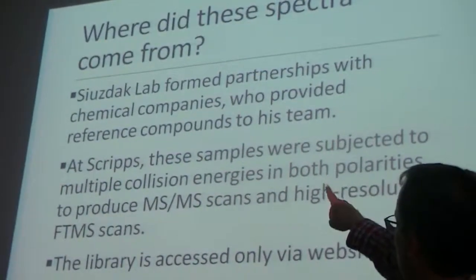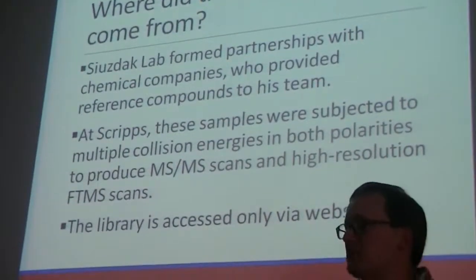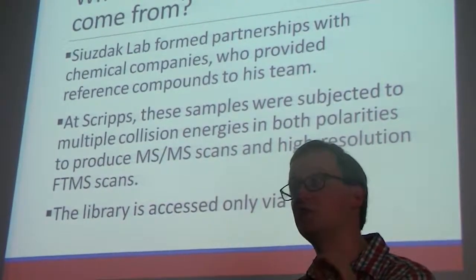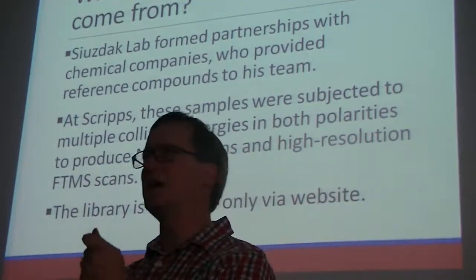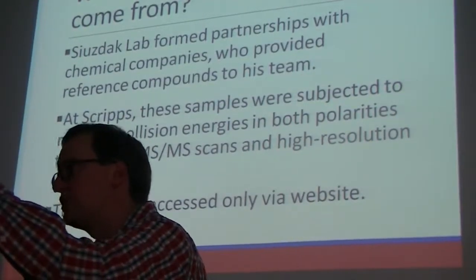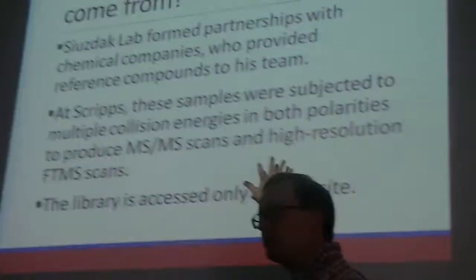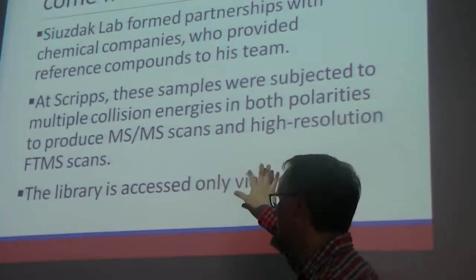So I've already mentioned all this business, but I would note one important point in the second bullet. Metabolites tend to change what fragments they reveal depending on how you beat them up. If you put them through beam-type collision-induced dissociation at a high energy, they'll produce a different set of fragments than you do if you just sort of tickle them lightly. So, being able to recognize how the fragments differ as a function of the energy you dump into them matters.